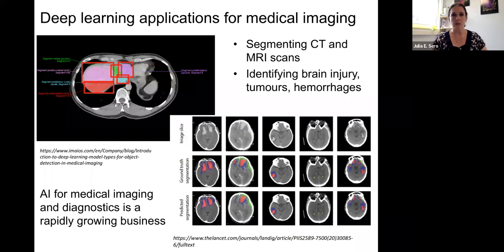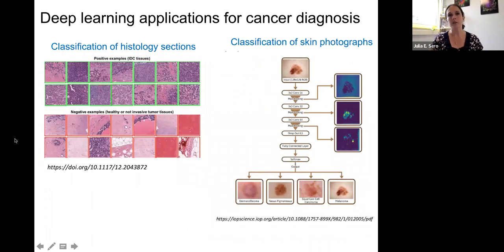So this is instance segmentation, but deep learning is also being used in just classification, without actually drilling down into what we are seeing. So here's an example of looking at tumor versus non-tumor tissue histology sections, and it was trained on some ground truth of samples that we know are tumors and samples that we know were not tumors, and applying a classification just to the image.